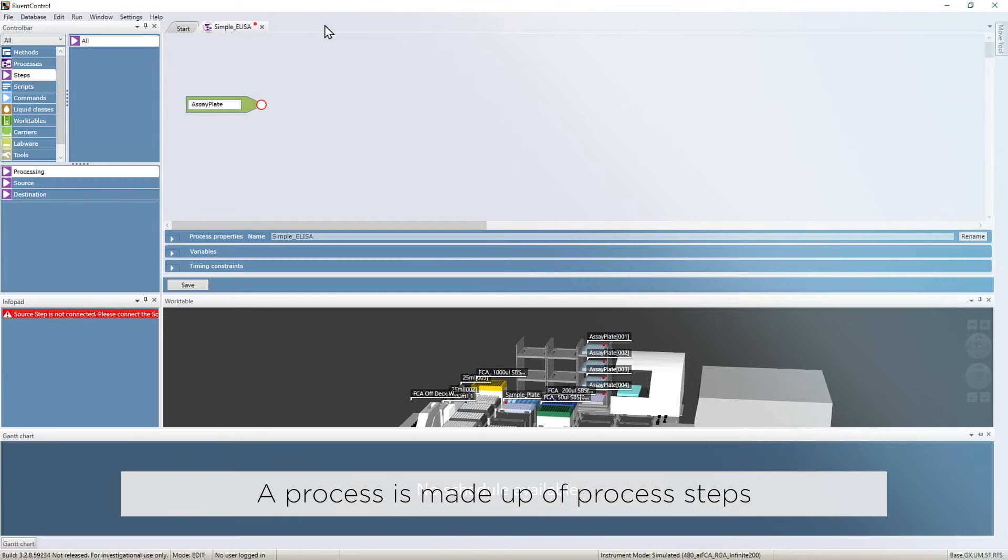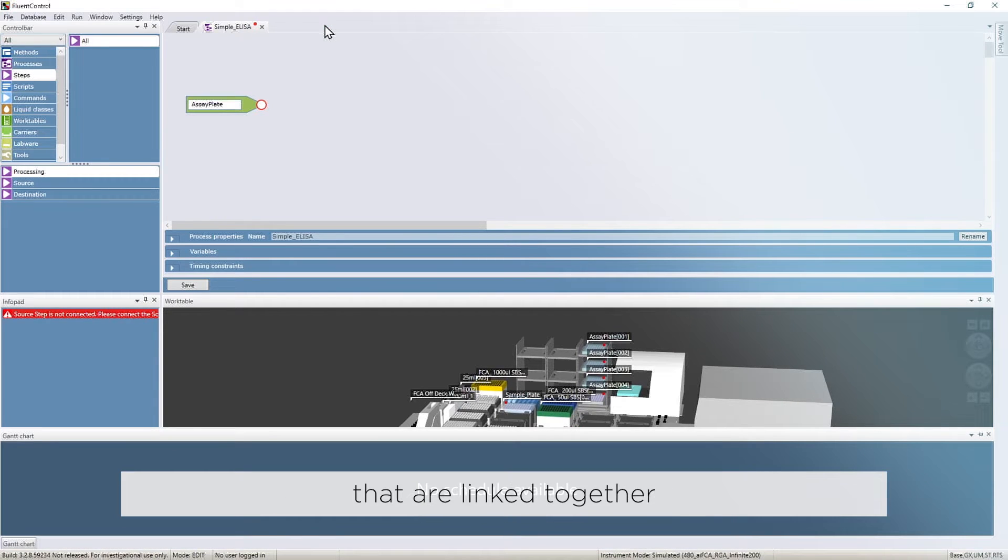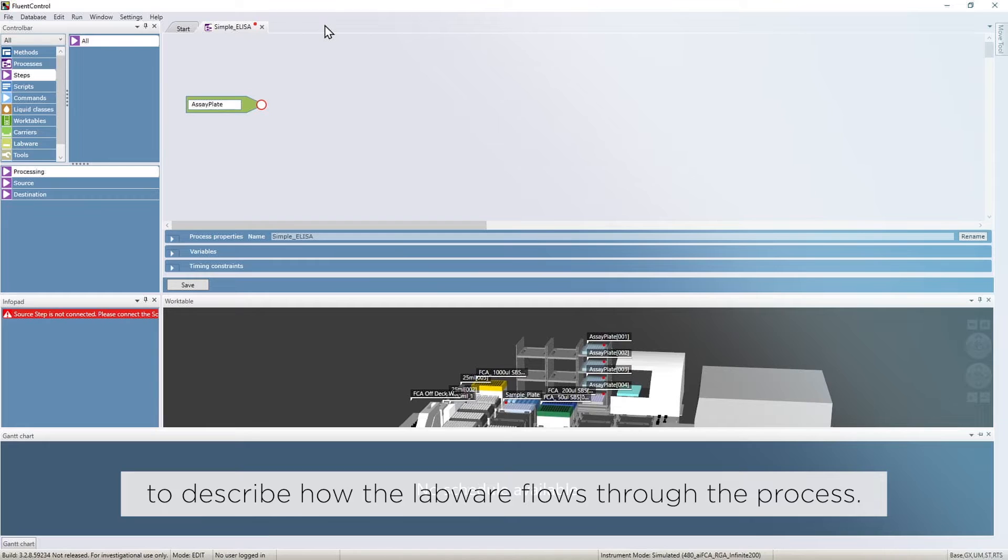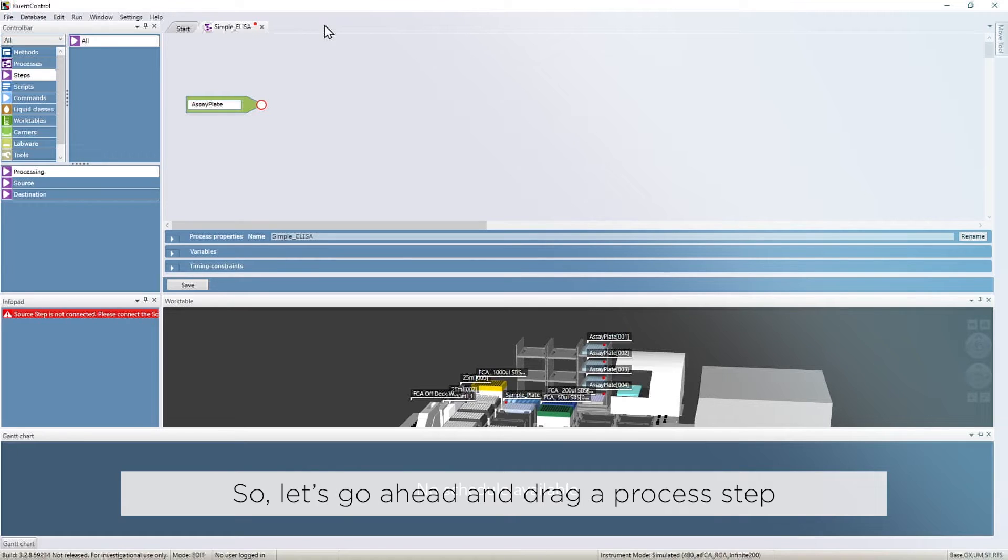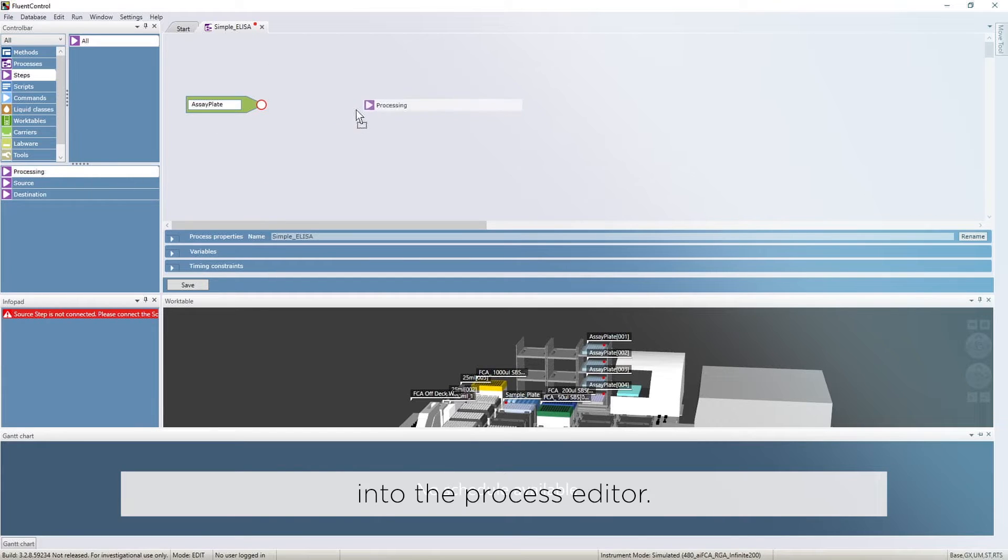A process is made up of process steps that are linked together to describe how the labware flows through the process. Each process step is schedulable. So let's go ahead and drag a process step into the process editor.